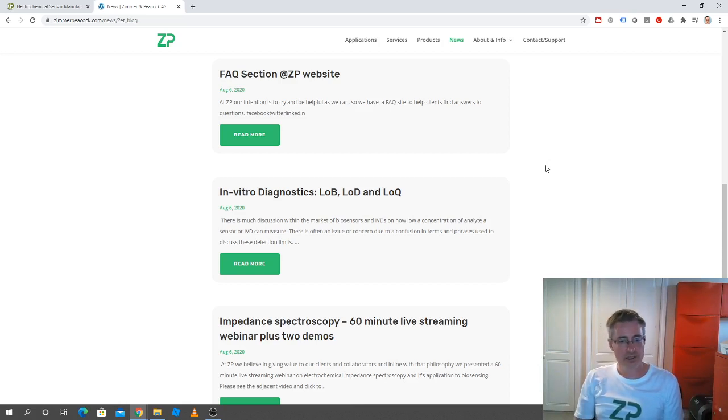And these numbers actually tell you how low a concentration of analyte you can detect without mistakenly having detected a blank. So it's how low can I go in my detection limit and be certain that I'm actually detecting something and I'm not just making a little error.